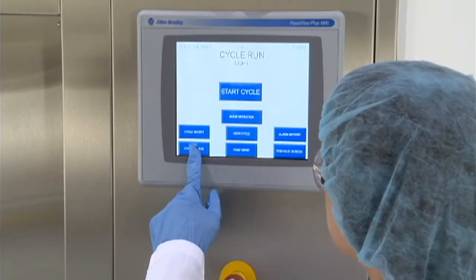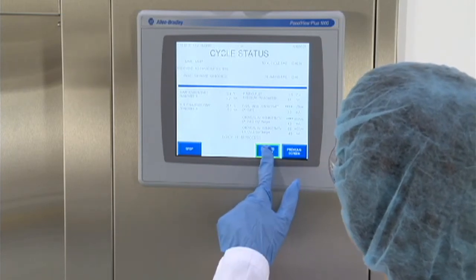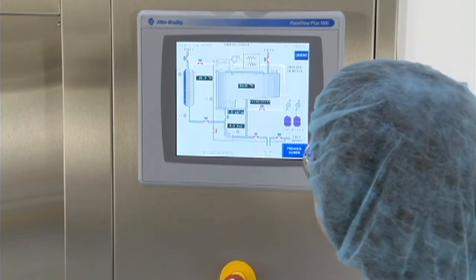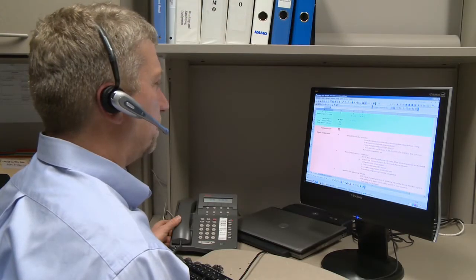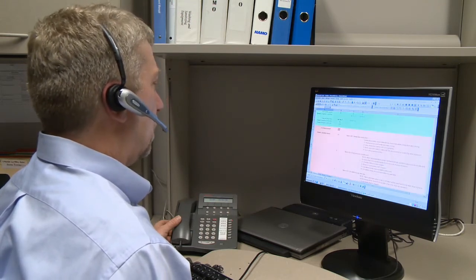The 380PG washer's advanced PLC control makes it easy to operate the system and monitor critical system parameters, and it can also be connected to the Steris ProConnect response center. ProConnect provides 24-7 remote equipment monitoring, helping reduce downtime and lower maintenance costs.